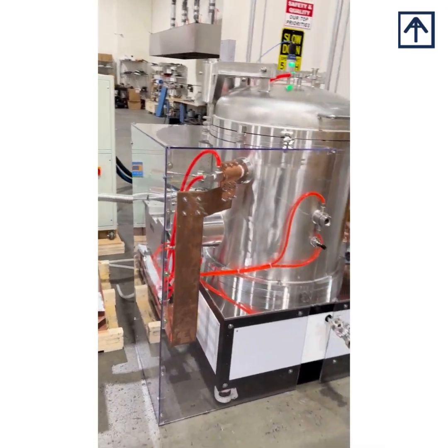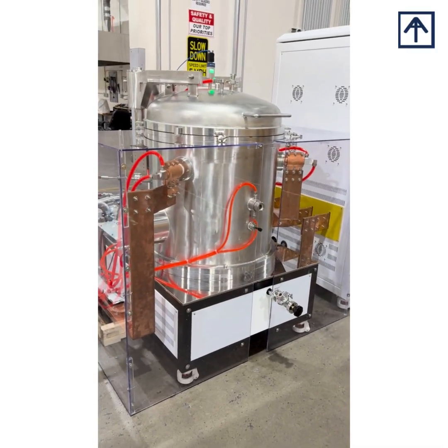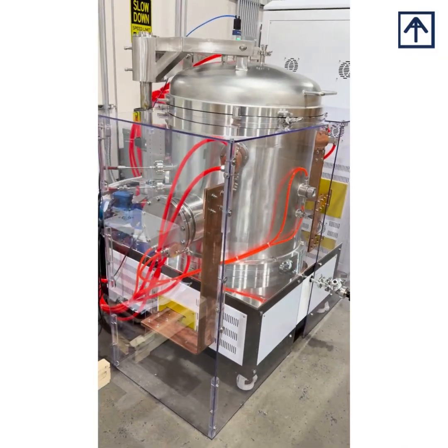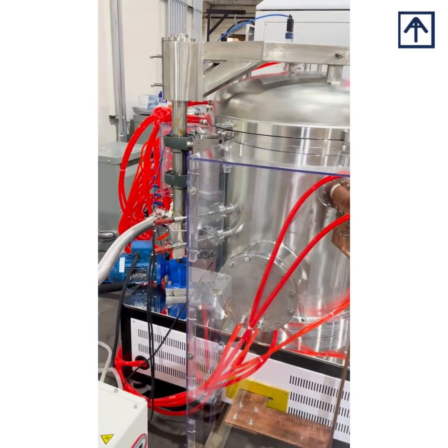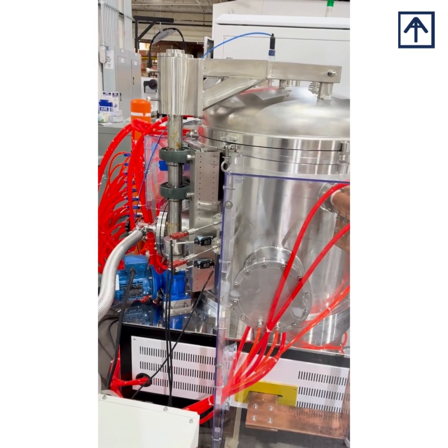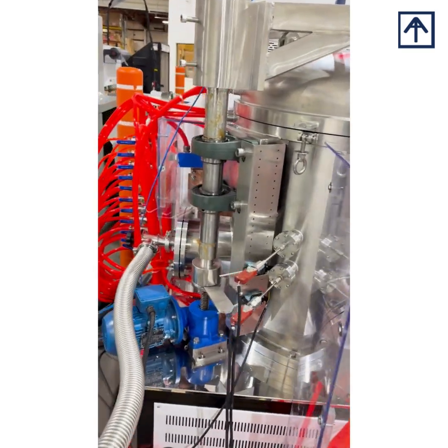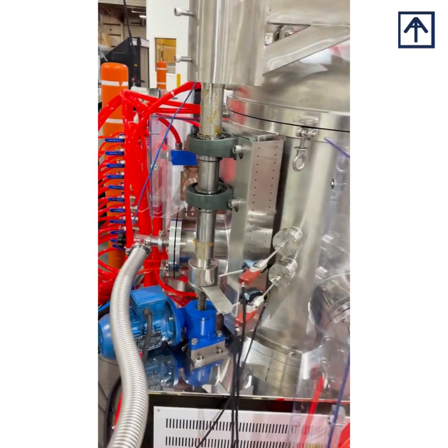And let's take a look around the unit. As you can see, the chamber itself has a polycarbonate enclosure, which lets the user avoid contact with any of the lines that are currently active while running the unit. The orange lines that you see are for the water lines. That's the cooling jacket, and that is your lift motor for the lid. So it's all electrically controlled, and you can lift the lid from there as well.